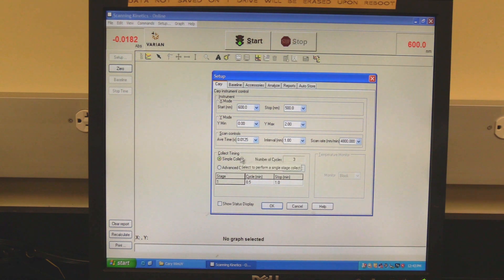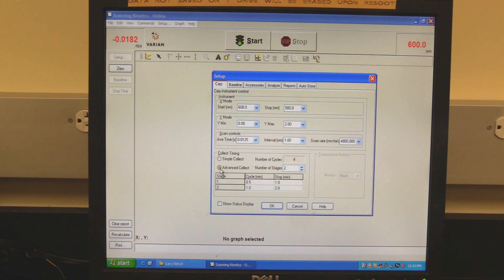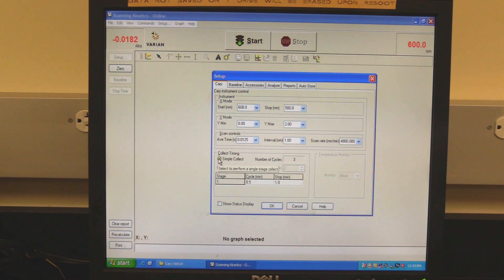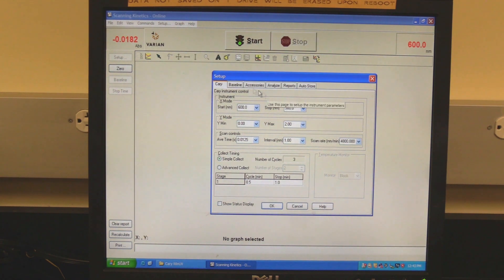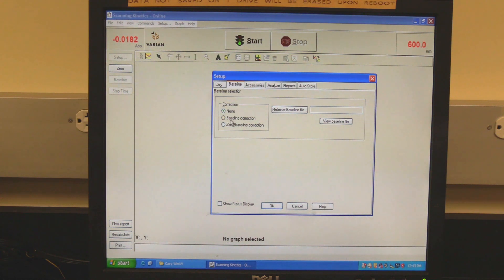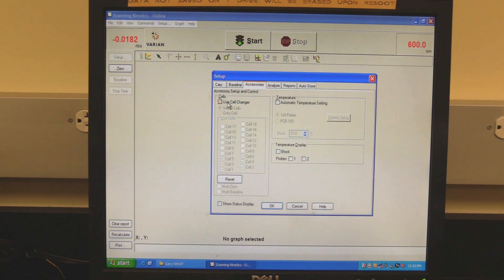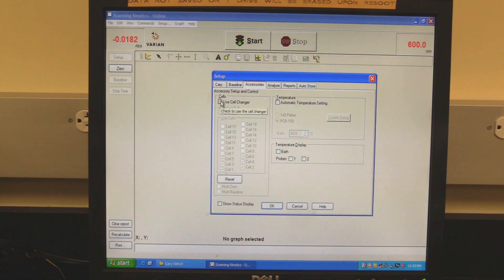In Collect Timing, select simple or advanced collect. Use simple if there is only one stage; use advanced if there are multiple stages. In the Cycle column, set the cycle duration; in the Stop column, set the end time of the reaction stage. Click on the Baseline tab — to automatically subtract the baseline, select baseline correction. Click on the Accessories tab. To use the cell changer, check the Use Cell Changer box and check the boxes for the desired cells.